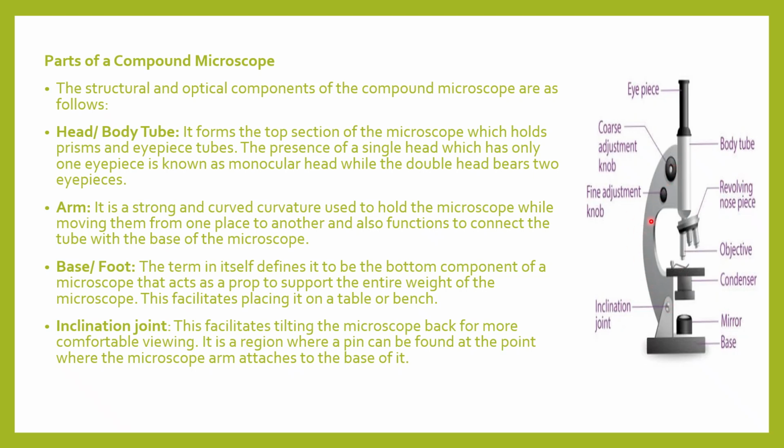And yes, it is also a region which connects the base and the body tube. Okay, and then next is base or foot. The term in itself defines it to be the bottom component of a microscope that acts as a prop to support the entire weight of the microscope. This facilitates placing it on a table or a bench.